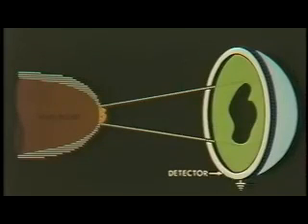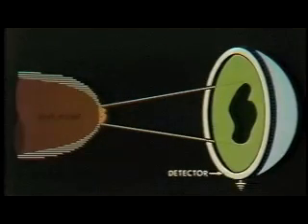Can I have the final short section of tape, please? I'm going to show you it in real time. This is a rather unusual one because these are results that came this summer, in which we used water as the ice layer. The real advantage of using water if you do biology is that you don't have to take the molecule out of the water in the first place and put it in vacuum. You can freeze it in the water, transfer it cold into this microscope, remove the water as you apply the field, and get an image.